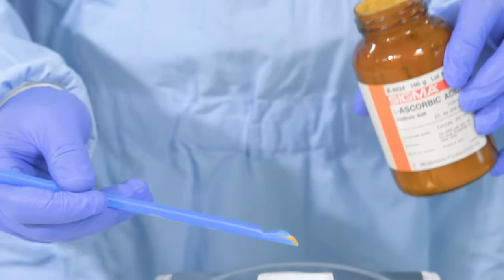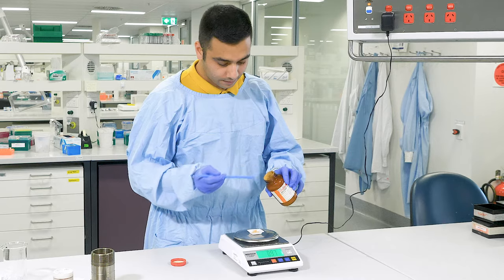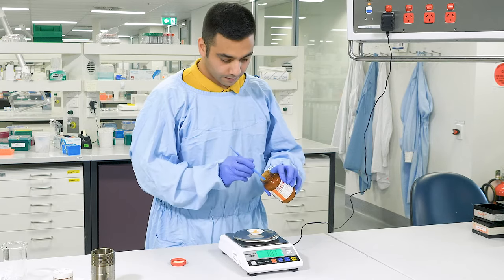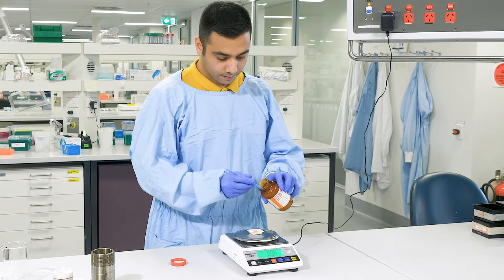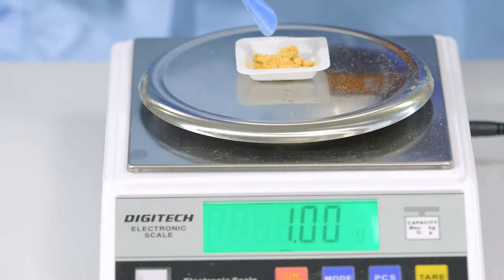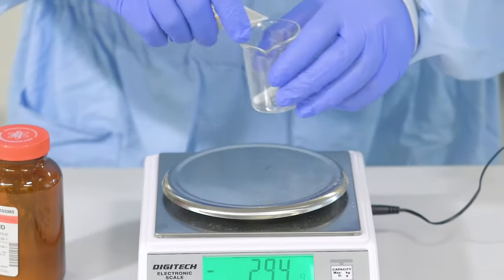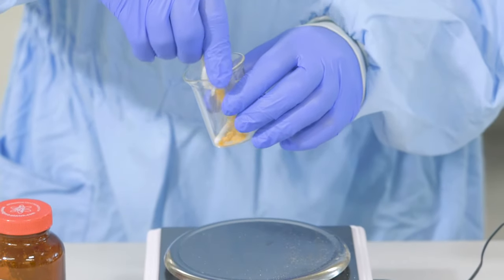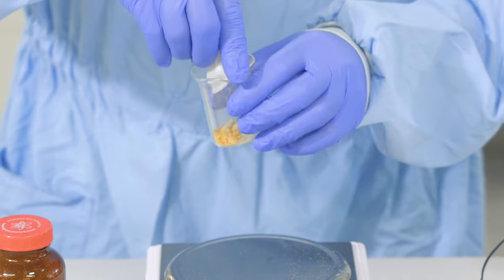Firstly, I weigh 1 gram of ascorbic acid powder. Using the scoop, I add the ingredients until I can see a number as close to 1 gram as I can get on the screen. Now that I have finished weighing the ingredients, I transfer it to the beaker carefully.